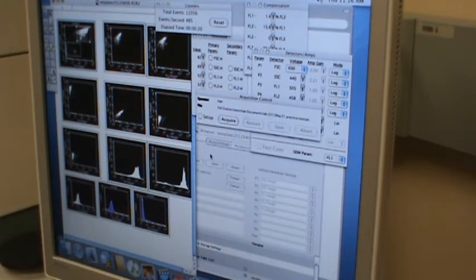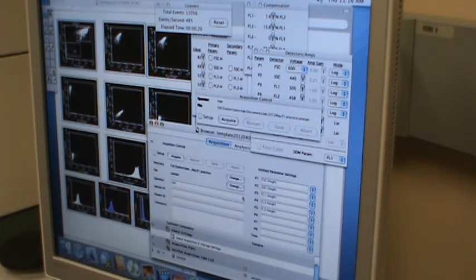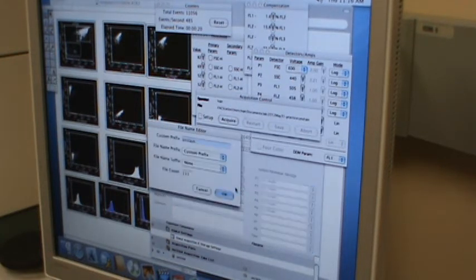Alright, and now always remember you want to change the file name. Otherwise everything will be stored in the same file. In the end you still don't have all the data you want. Okay, so this file will be number 1 as live cell. But we will see whether it's live or not, hopefully live.